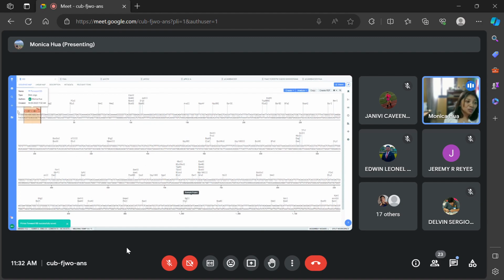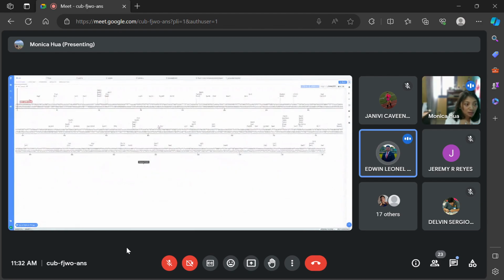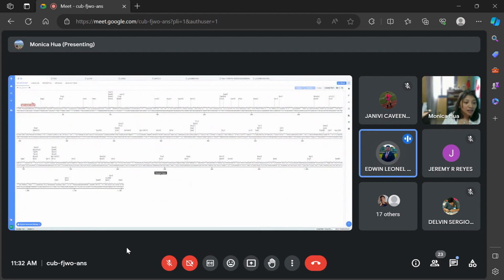Sorry, I don't know what's happening with my bench. I think the primer is added before now.